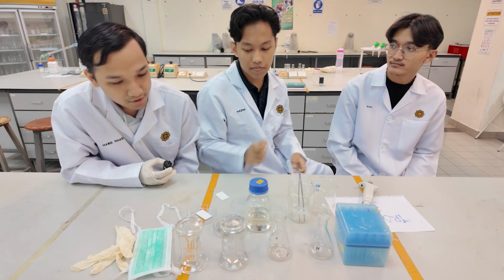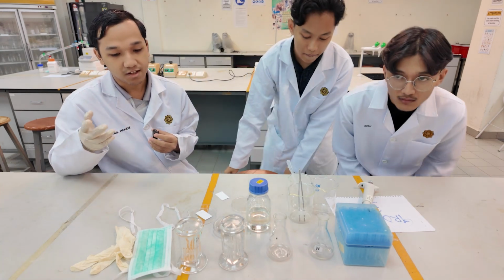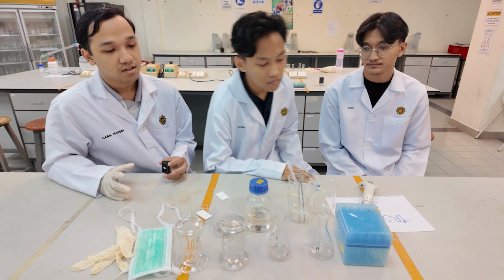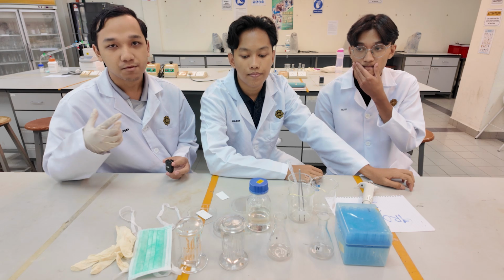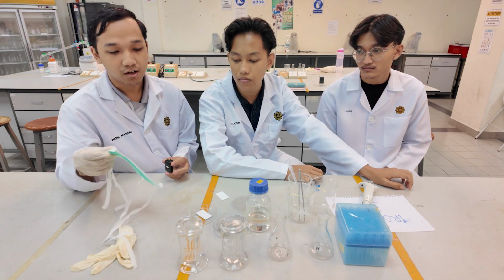Okay. So now I will highlight some key safety precautions and health concerns while working in this TLC. Okay, first is general safety measures, like we need to wear PPE, like lab coat and mask.